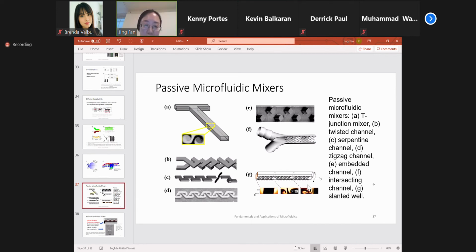Where mixing takes place, yeah, the mixing takes place in the whole twisted channels. At the beginning, they are separated, but in the process, as they meet at the junction, for example, here is the first junction, and then they split, they mix here, then they split. Then they may reorient and travel to the next junction and mix here, then split again. So during this repeating periodic mixing, combining and splitting, at the end of this twisted channel, they will be thoroughly mixed. Okay. Yeah.